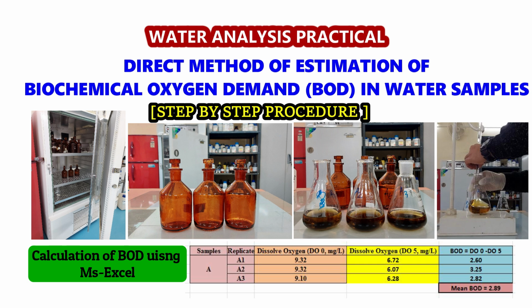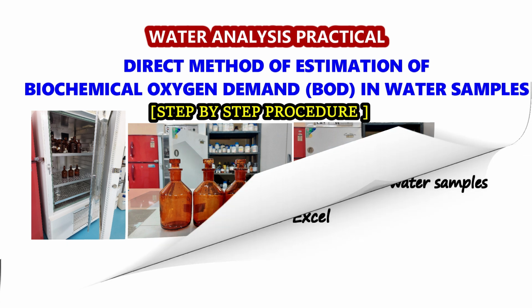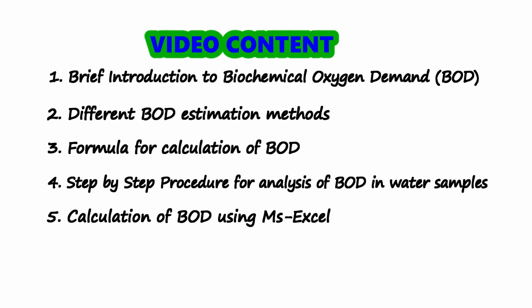In this video, I'll show you the step-by-step procedures involved during the analysis of biochemical oxygen demand, or in short, the BOD analysis in any water samples by adopting the direct method of estimation. For your convenience and information, the content of this video revolves around the following.